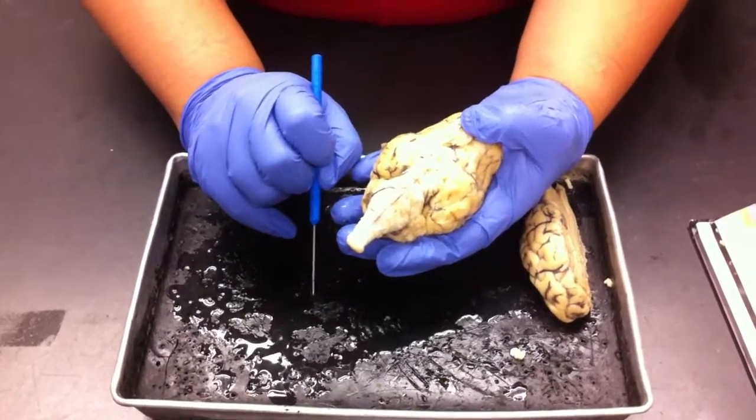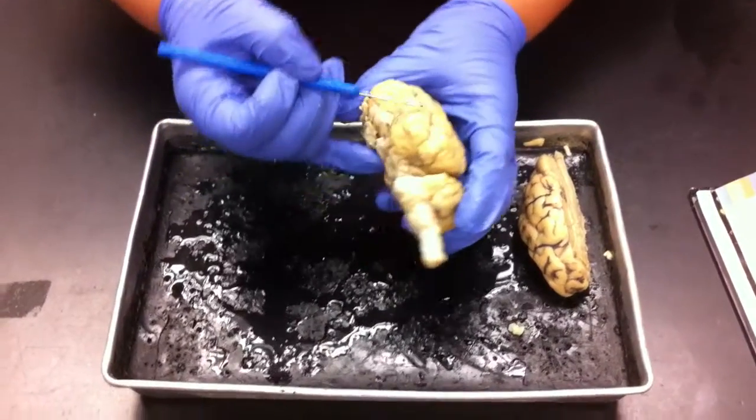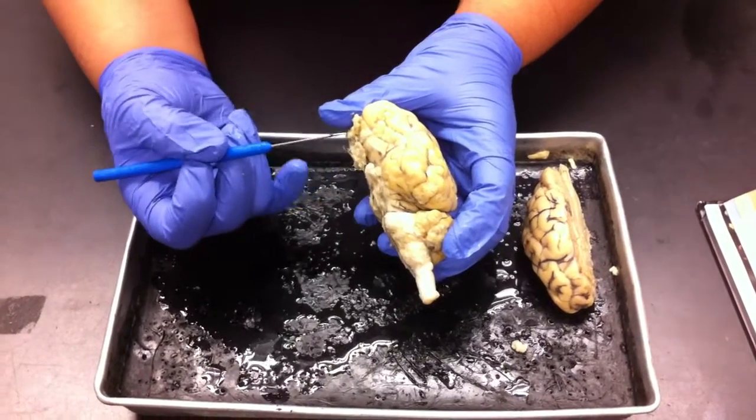Any questions on the superficial anatomy? Where is the lateral sulcus? The lateral is coming from the top, going down the way. Okay. Top.